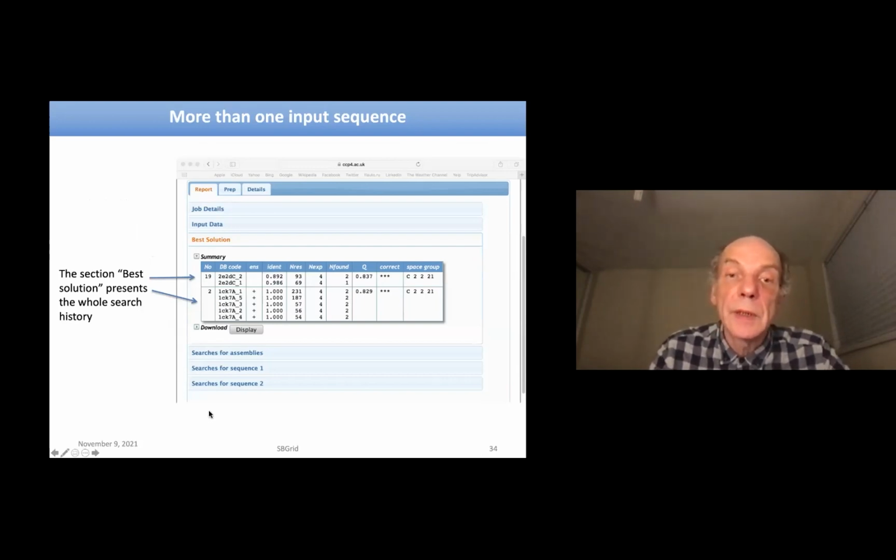And we see that in this case, 5 domains were in one chain, and there were 2 domains in the other, which was bigger, or actually not. Nonetheless, this was quite easy to solve.